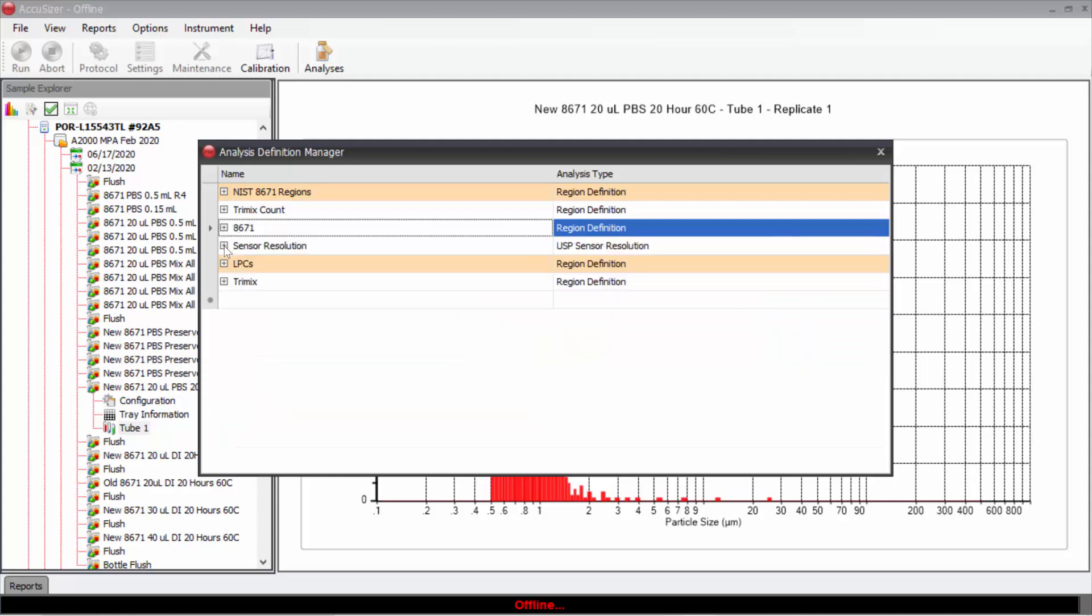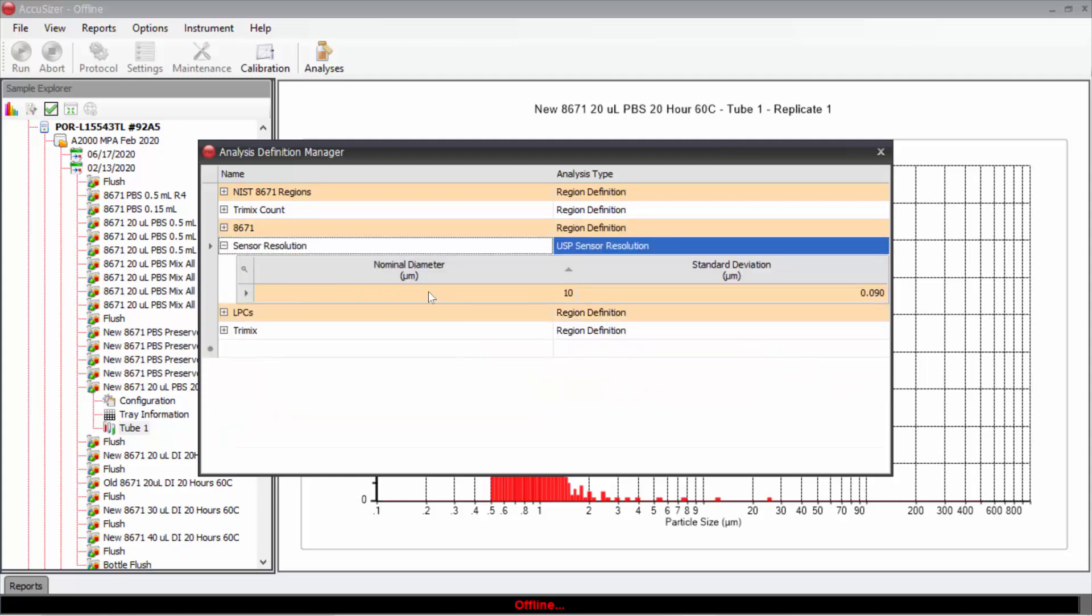Here is an example of a region for doing the USP 788 sensor resolution where I really just enter the size and the standard deviation.